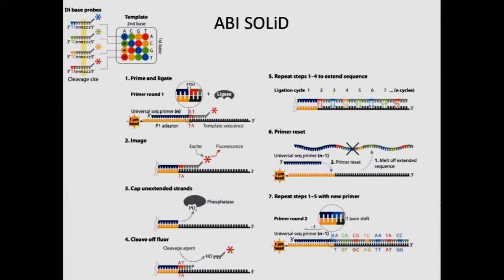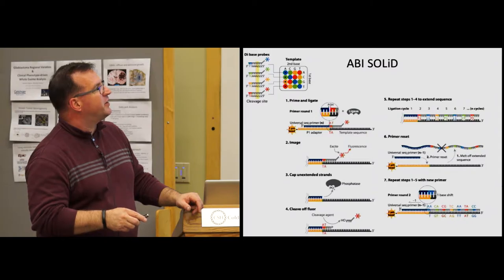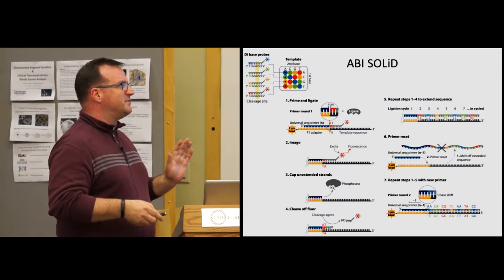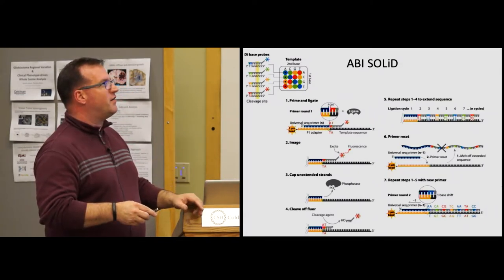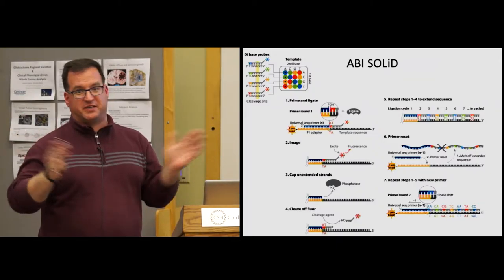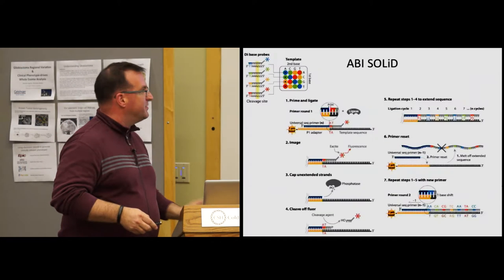And now you're going to go again into another cycle. Essentially at each cycle, you're going to read off a color in that spot. Just like Illumina spots, SOLiD has spots. You're going to read off the color at each spot, but you're only going to see the color. You're going to see red, then blue, then yellow, then green, then blue, then green, then red, and you're not going to know which of these it is. Okay? So that sounds great. I've sort of sequenced it, but not. But you've actually gotten a little bit of information. You now know that at this position, these two bases are one of these four pairs. So you've reduced yourself from 16 possibilities to only four possibilities. Sounds good?